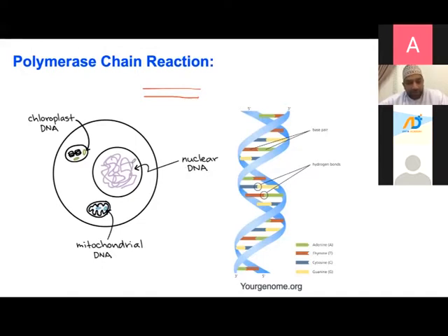People who come from an agriculture background can use genomic DNA or chloroplast DNA. Another thing we can also work with is mitochondrial DNA. And there is another thing called cell-free DNA. This is DNA which is not inside the cells; it is actually in your circulation. There is a lot of talk about it, and there are new techniques coming up in the diagnostic area, especially in cancer, where people use cell-free DNA. This DNA can be in the circulation, inside exosomes or extracellular vesicles. You can also use DNA from viruses and from bacteria. It all depends on what type of application you are doing.